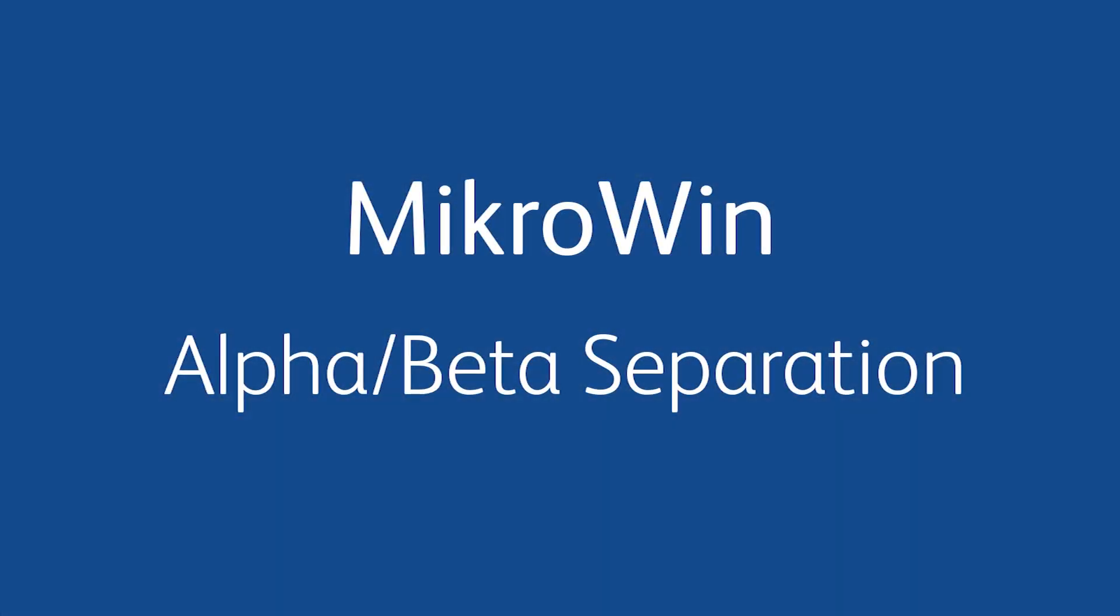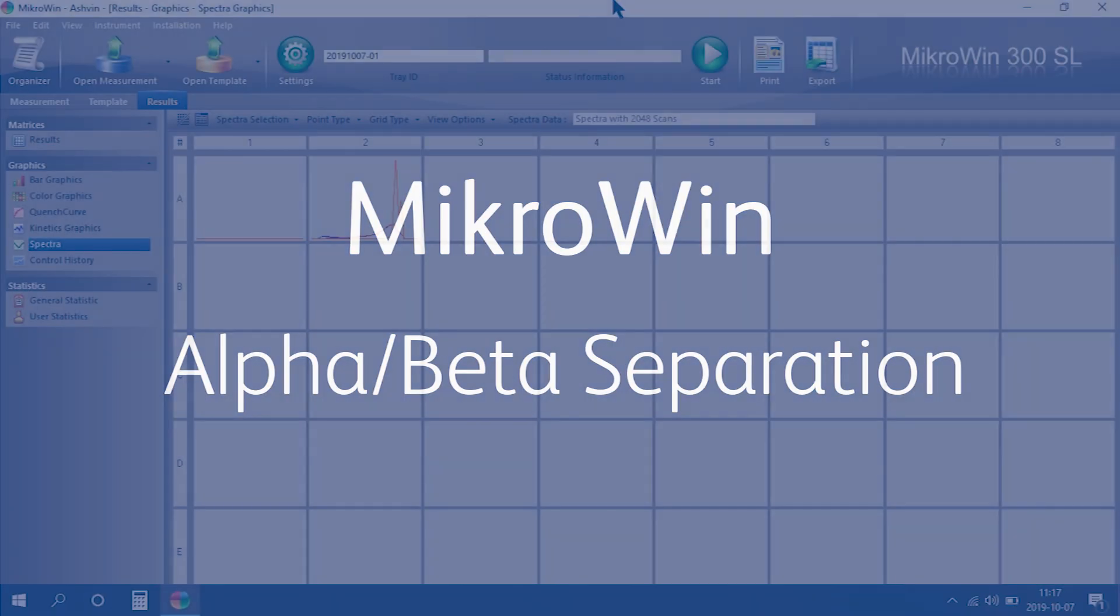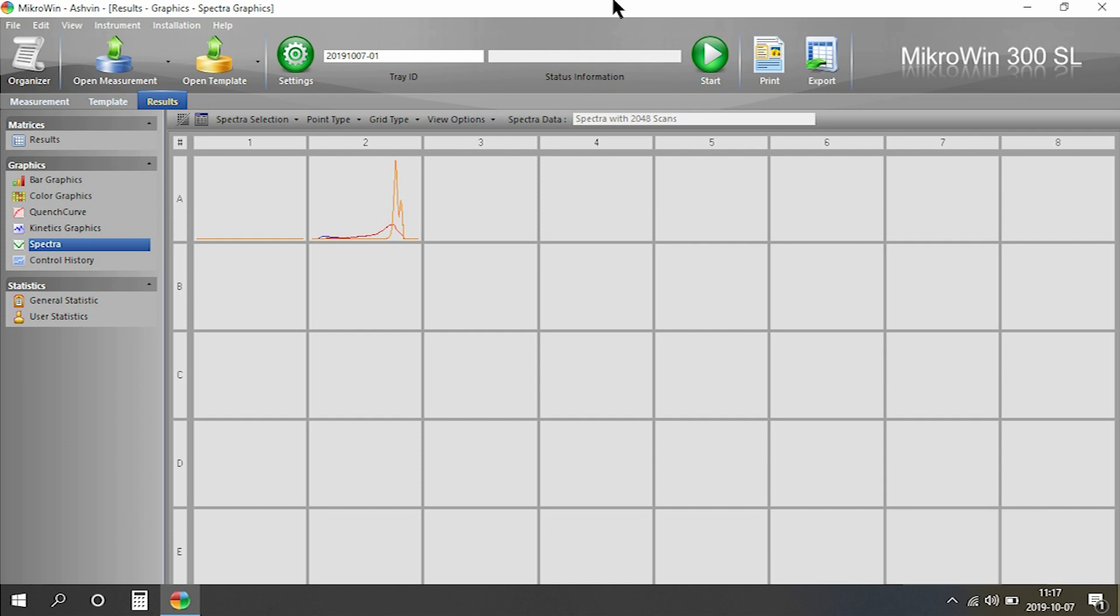In this video I'm going to show you how to optimize the separation of alphas from betas in Microwin, the software for the Hidex 300 and 600SL.